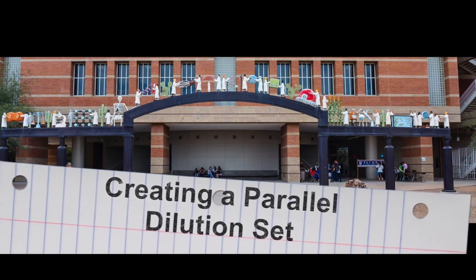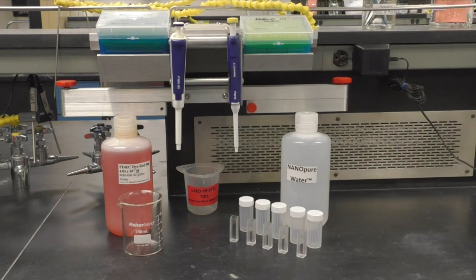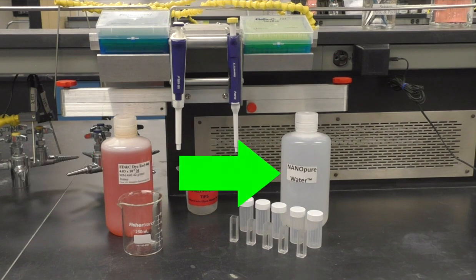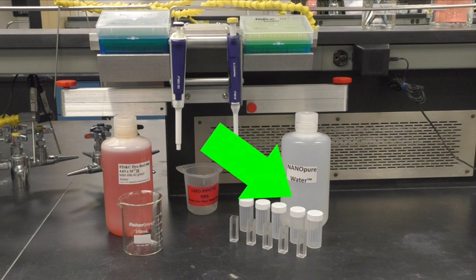This video will demonstrate how to create a parallel dilution set. To begin, you will need a stock solution of the chemical with a known concentration, a solvent, and a vial and cuvette for each solution you plan to create in the set.